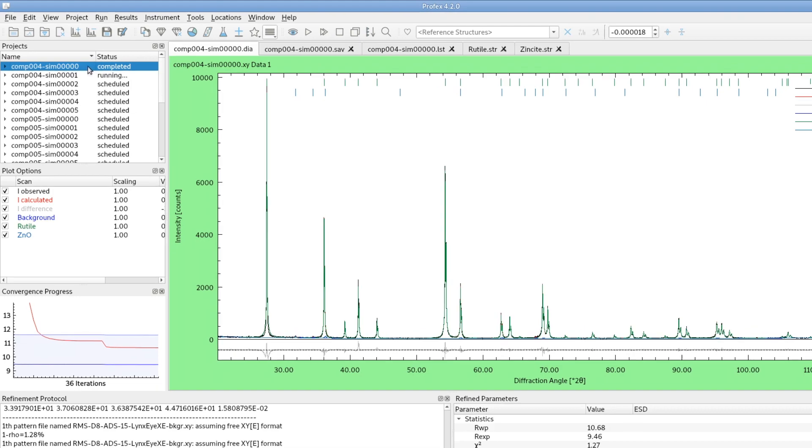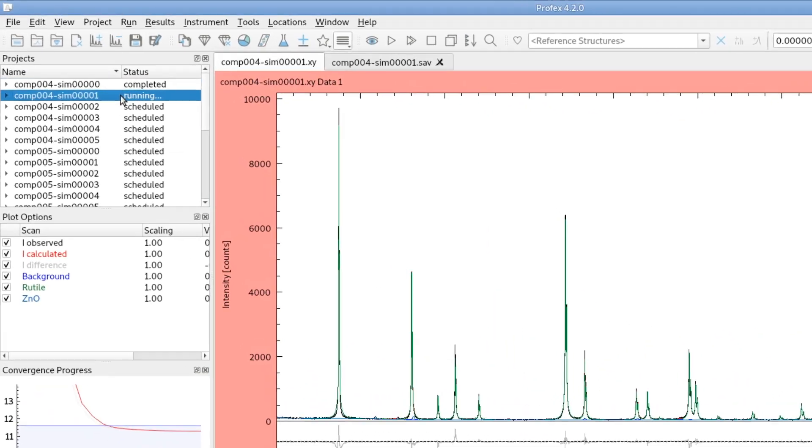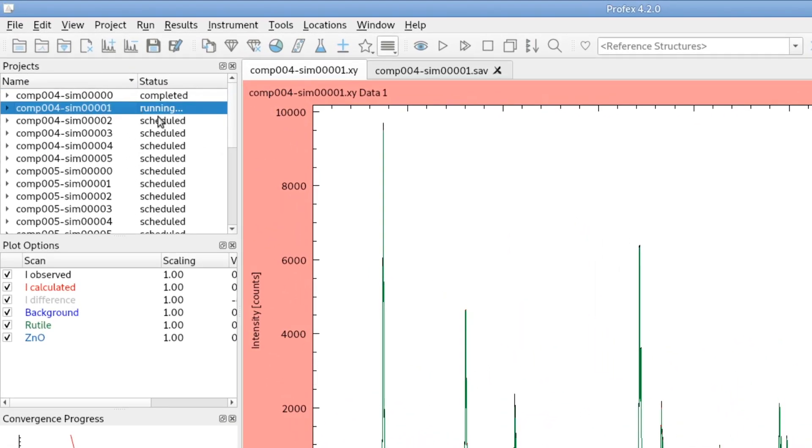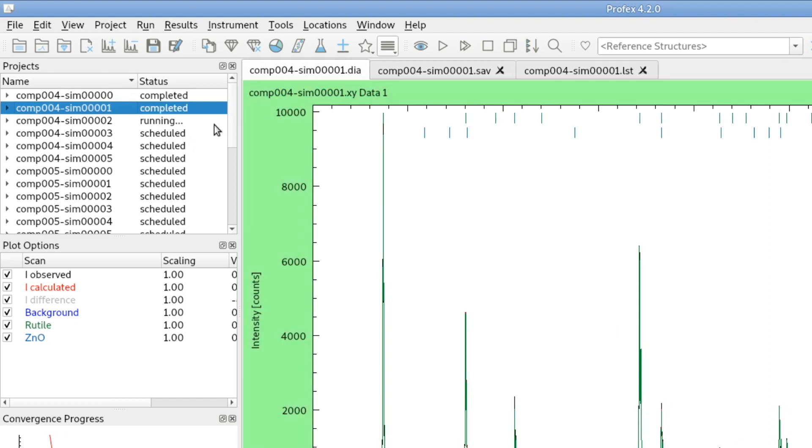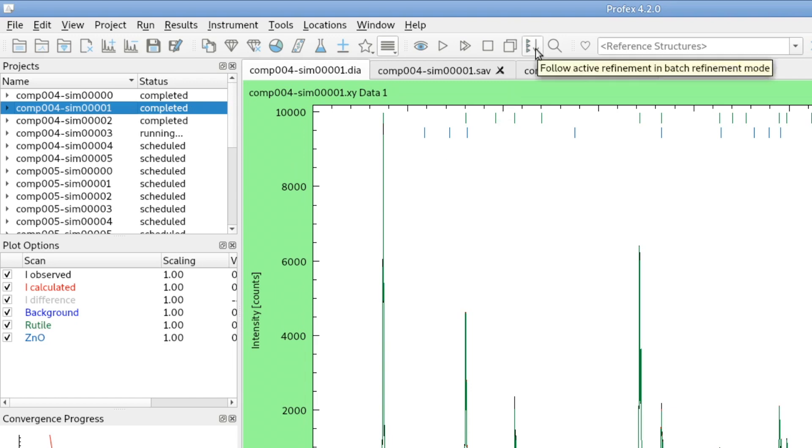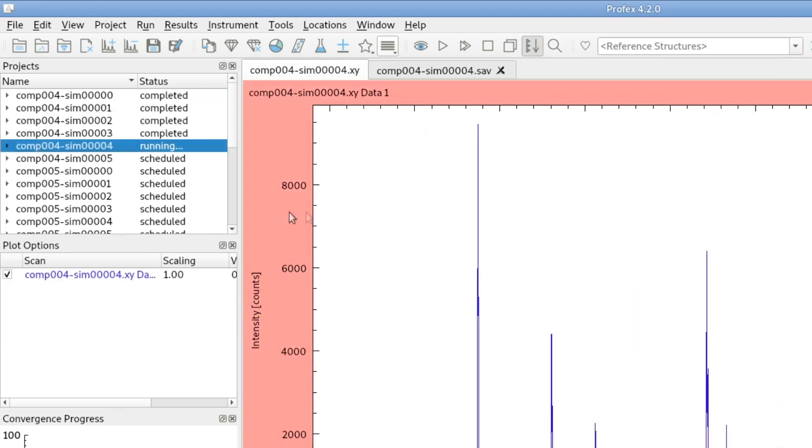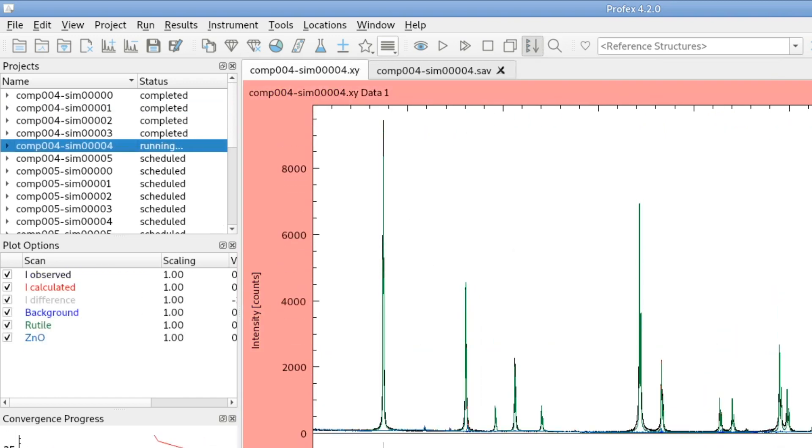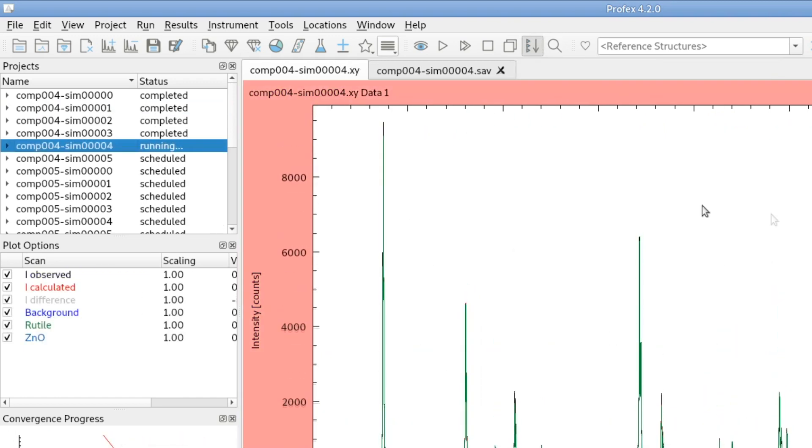As you can see, the first one started and all the others are scheduled for refinement. It will go through the list of scheduled projects and refine one after the other. And if I click this button up here, follow active refinement in batch refinement mode, it will always jump to the running project, so I can follow on the screen the progress of the batch refinement.